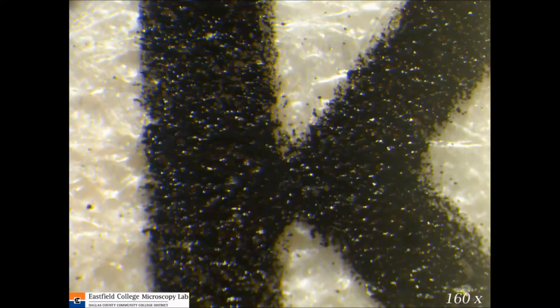Let's double that magnification. This is what it looks like at 160 times magnification. The white paper looks white because white reflects all the colors of the spectrum. Black, on the other hand, absorbs a lot of the colors, and that's why the white looks so bright and the black looks darker.